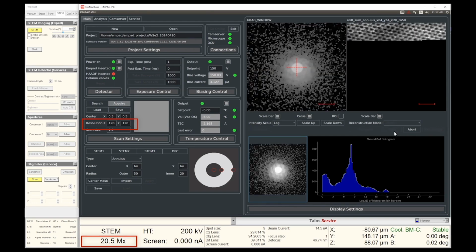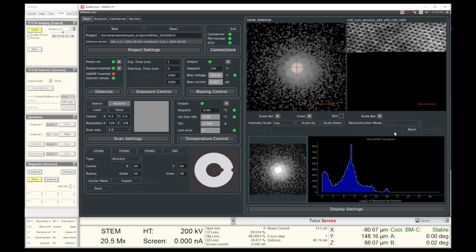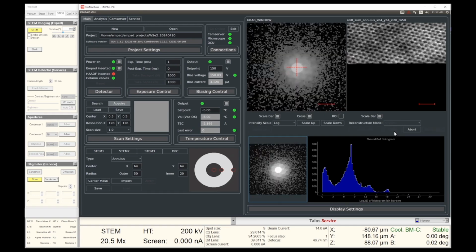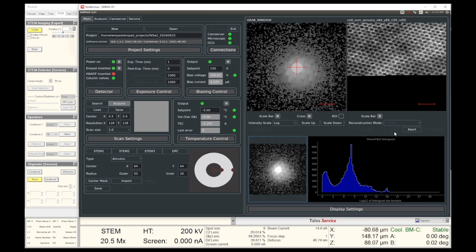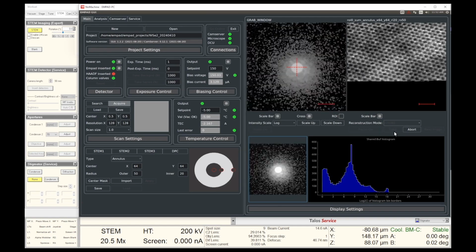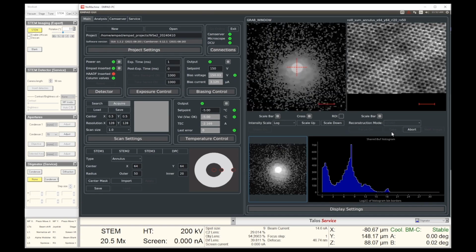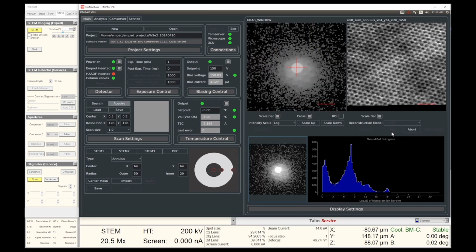For ptychography, capturing detailed diffraction patterns is critical. For this purpose, we require a camera with high dynamic range, linear response, and high-speed capability. These features ensure that we can accurately measure the intensity, which is essential for reconstruction. Therefore, we use EMPAD rather than the conventional CMOS detector.